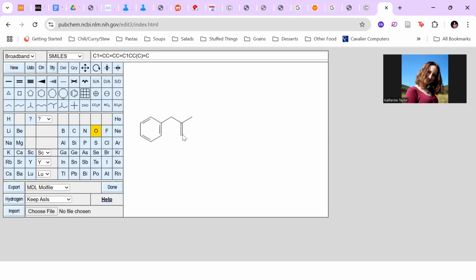All right. So here we have our carbonyl, and then we have our CH2 carbon right here. And then on the other side of the carbonyl, we have two more carbons left. We have one CH2 carbon, and oh no, accidentally did an oxygen there. This should actually be a single bond out to our sp3 CH3 carbon.